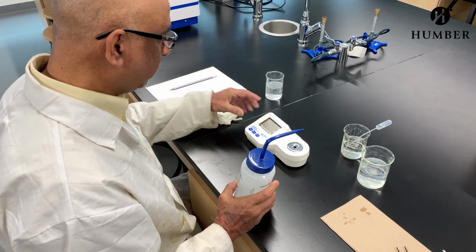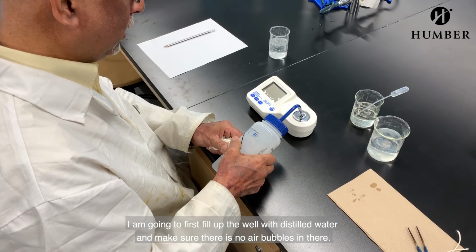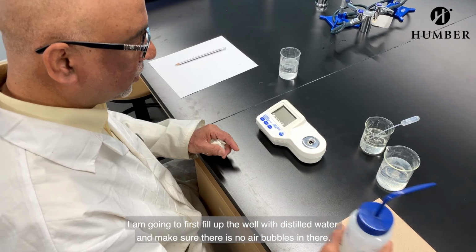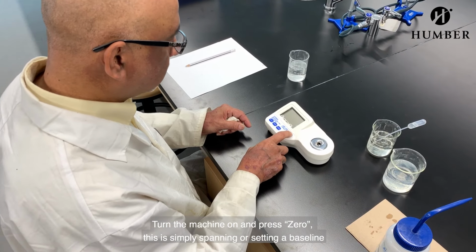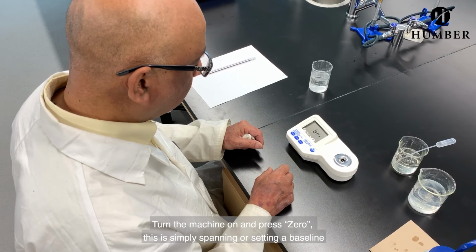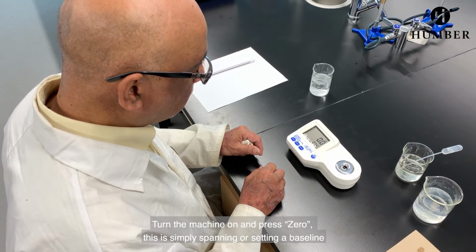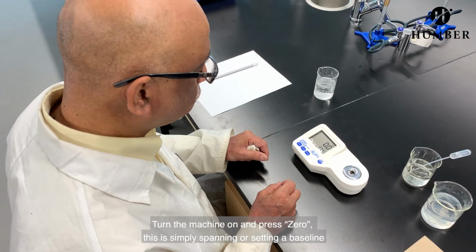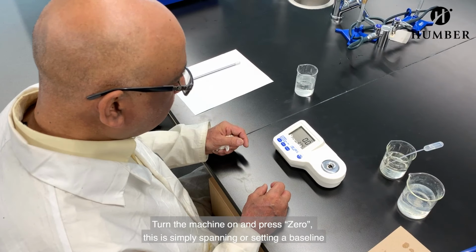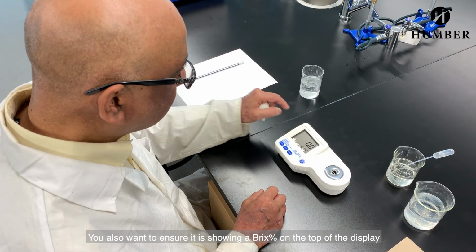This is a refractometer, and I'm going to first fill up the well with distilled water. You want to make sure no air bubbles are in here. Turn the machine on, and you want to press 0 to make sure it is showing you 0. Basically, we're just calibrating the equipment. You also want to ensure that it is showing you a Brix percentage on the top.